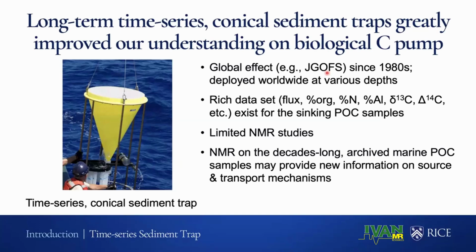This POC sample from the sediment trap has been extensively studied, and a rich data set such as the flux, organic carbon, nitrogen, aluminum content, delta carbon 13, and delta carbon 14 exists for these POC samples.